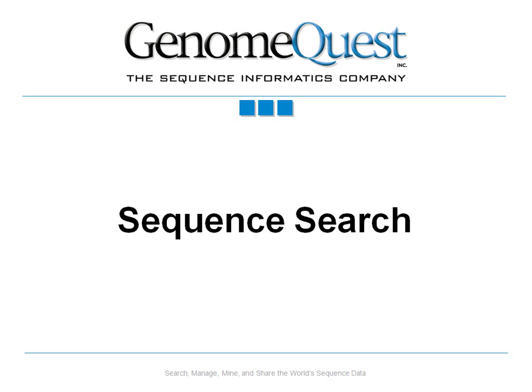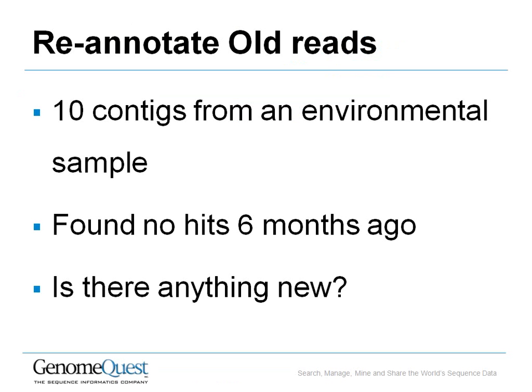Sequence search involves looking for hits in reference databases to our query sequences. We have about 10 contigs from an environmental sample that were analyzed six months ago and found to have no hits. And the question is, is there anything new now?